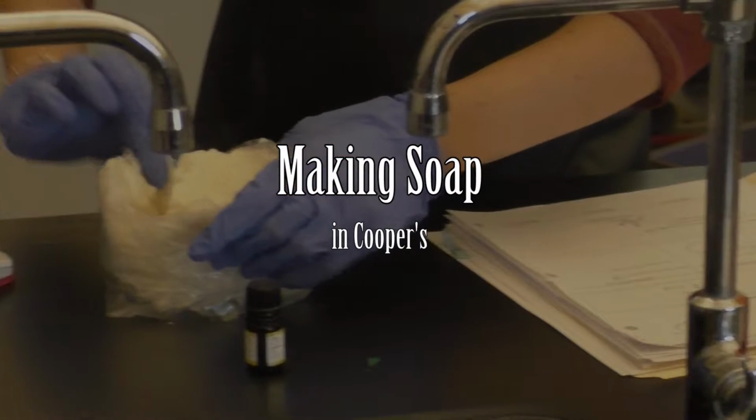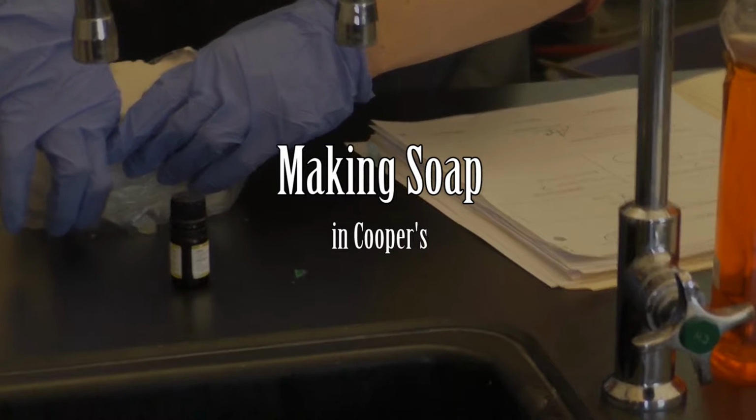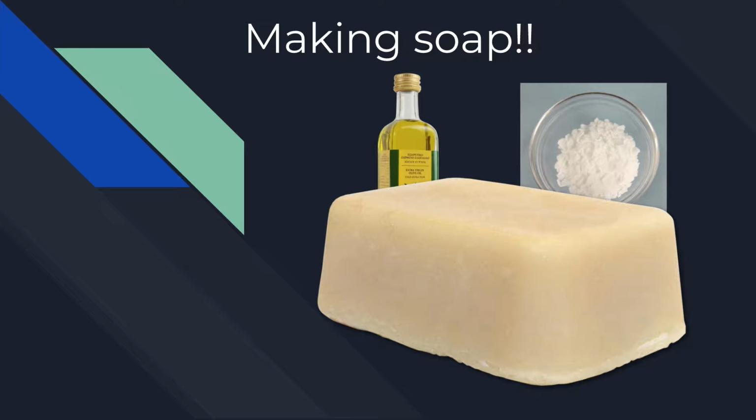So for our final in Mr. Cooper's class, we had to make soap. It was actually an awesome experience, so I thought I'd share it with you. There are two main ingredients for making soap, oil and lye.